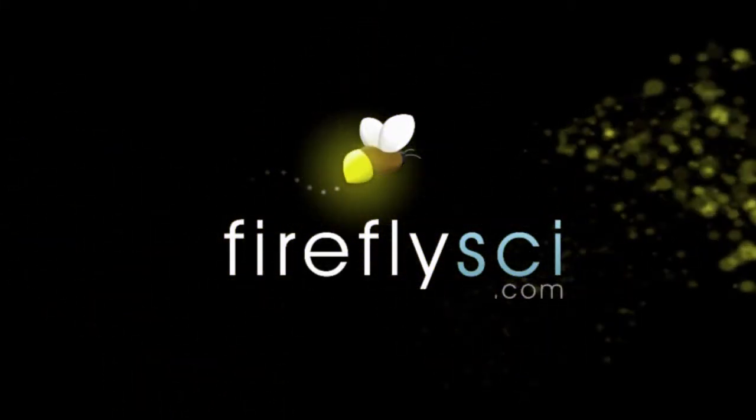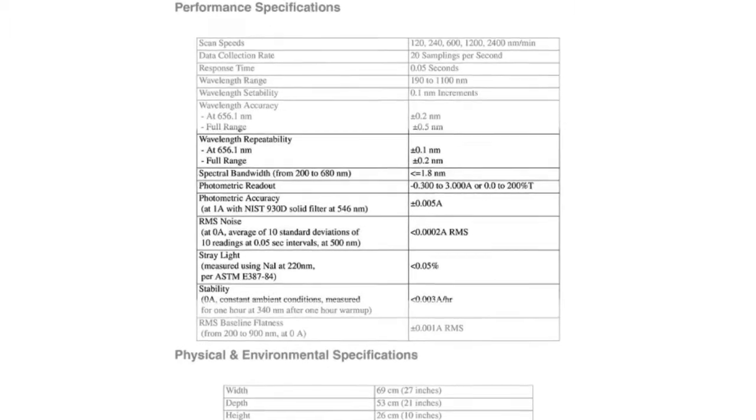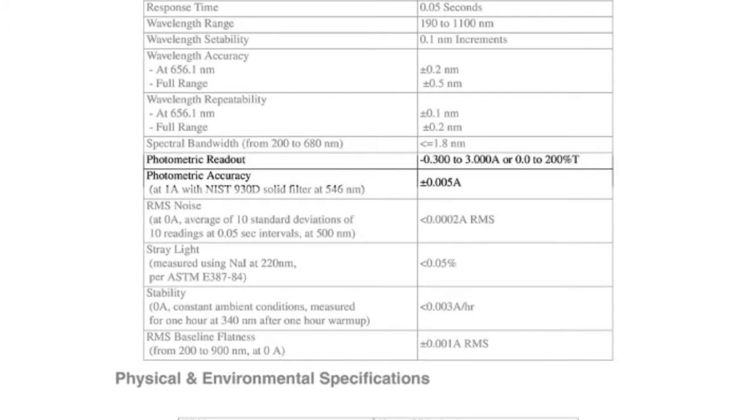And let's go ahead and get started. Let's take a look first at how to find the tolerance of the spectrophotometer itself. Now, this is often overlooked when people do calibration, and the place that you find it is in the owner manual of the spectrophotometer. And you can find both the photometric accuracy and the wavelength accuracy in the manual, and it'll look something like this here.